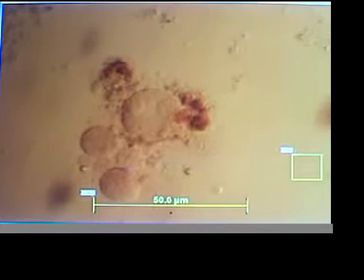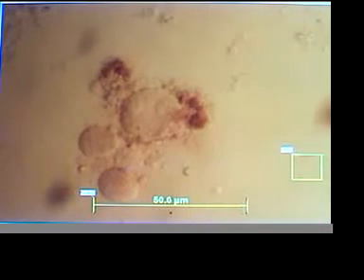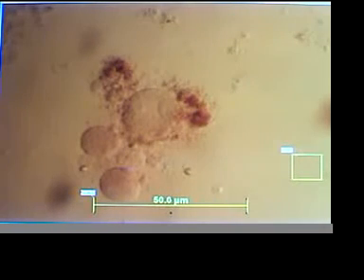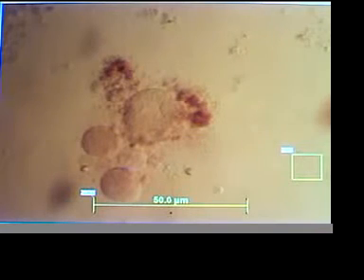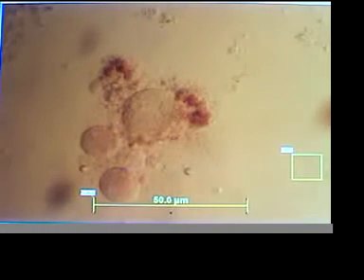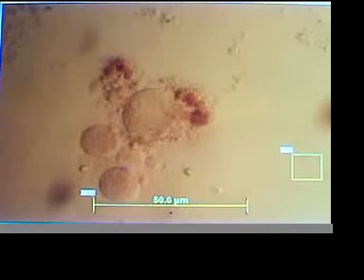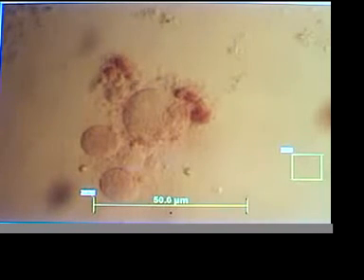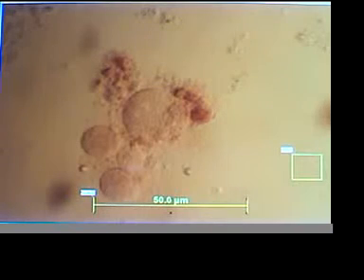Let's see if we can't focus a little bit more. It's a little tricky with this half filter technique, but it does give you a really nice surface view of things. Excellent. Double devitalization. Blepharisma. This is Monday, August 27th, 2007. 929 hertz plus 10,164 hertz. A 100 watt plasma bulb, SWR 1.2.